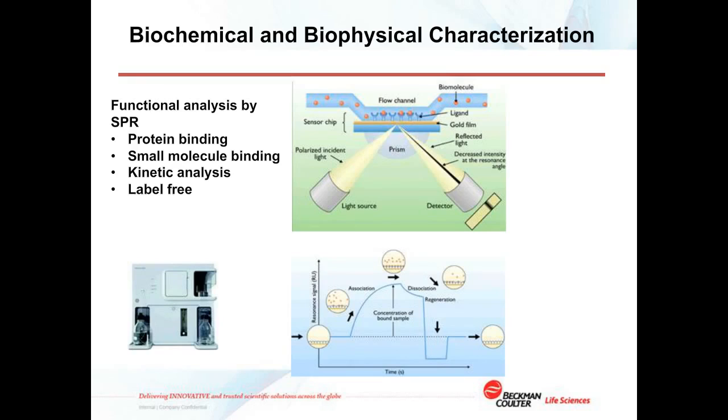So during the biophysical and biochemical characterization process, surface plasmon resonance is also often used in order to measure, in a label-free manner, the binding and the affinity of an immobilized protein on a gold surface with proteins that are flowing in solution.